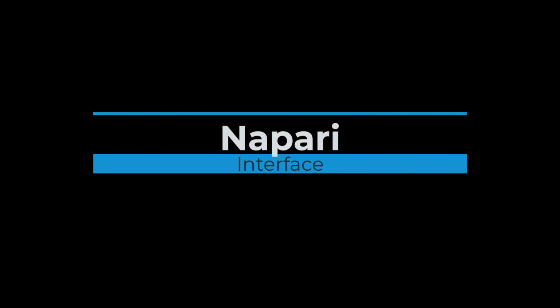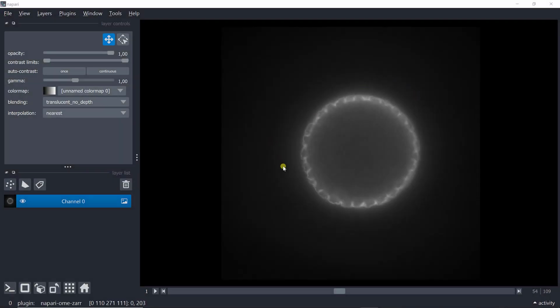In this video, I'm going to show you the functionalities you can use in Napari for visualization. So here I have the image I opened before I converted into ZAR. And you have several sections. So the one at the bottom left part of Napari here, you can actually change these things.